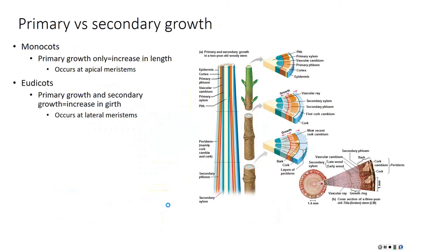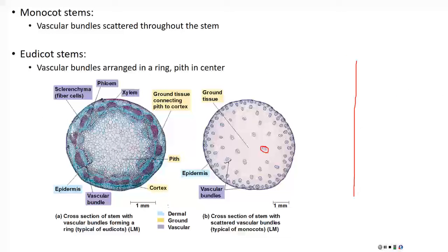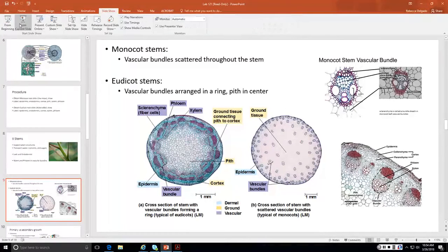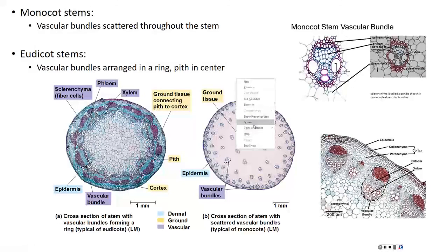So do I have an up close? I don't have an up close vascular bundle here. So let me get one. Okay, I wanted to look at that a little closer. Slideshow, current slide. Okay.